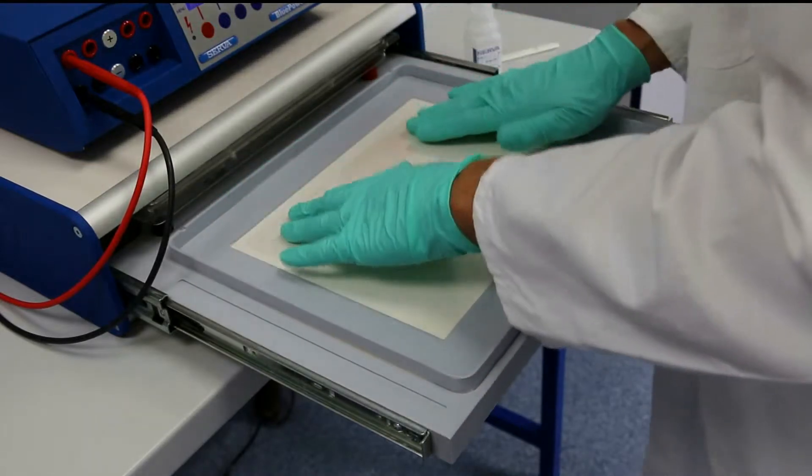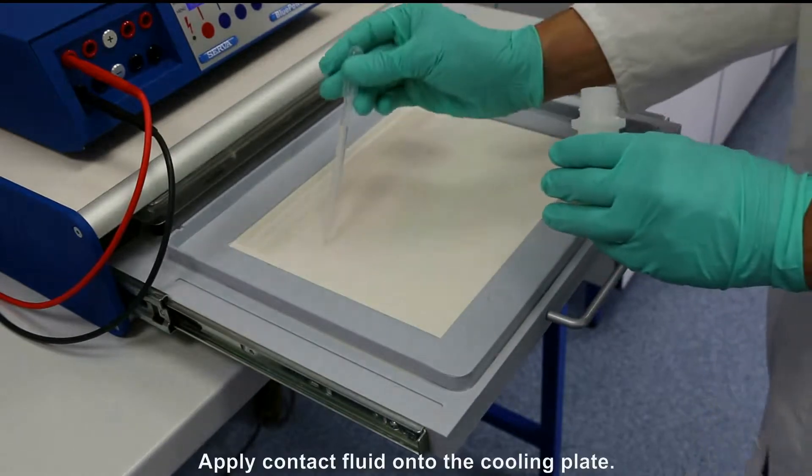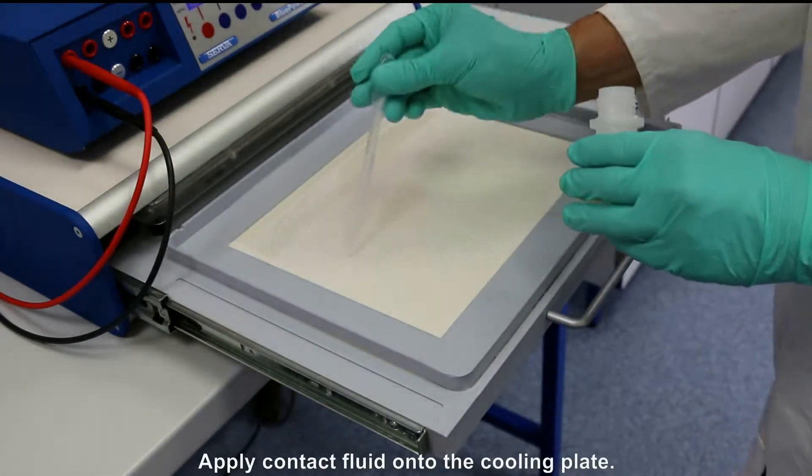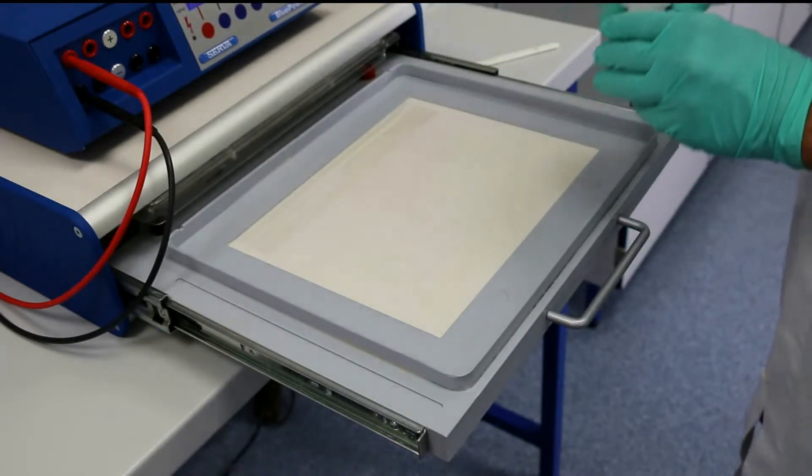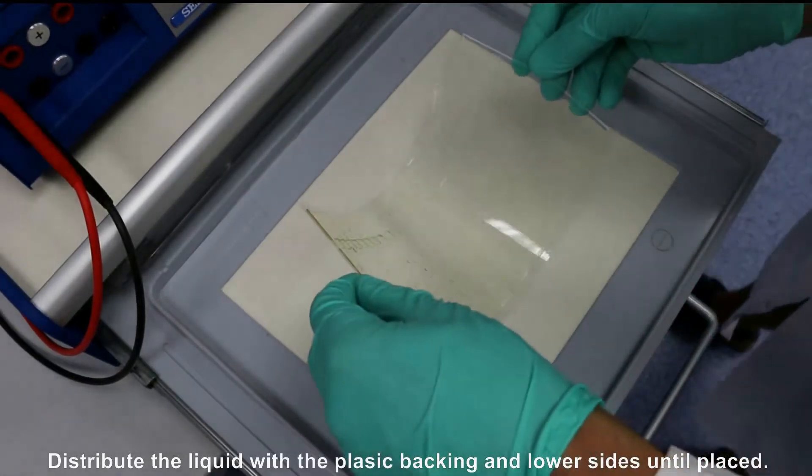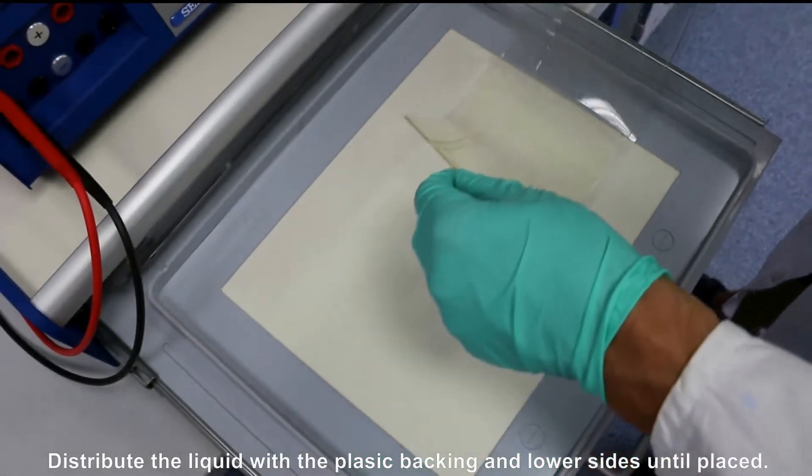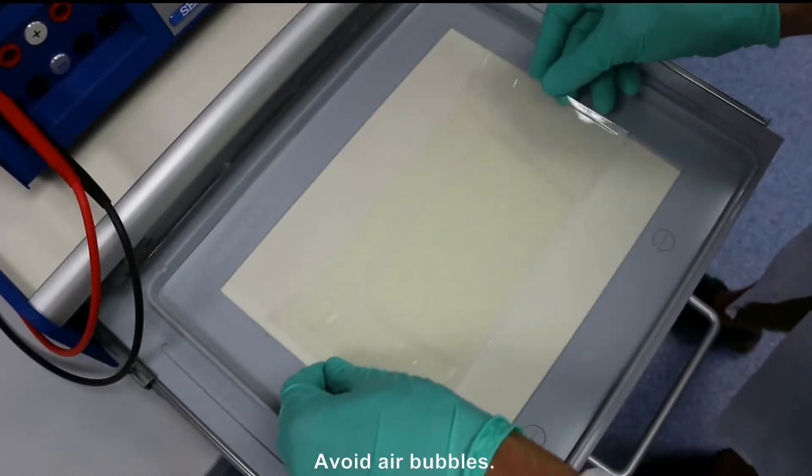First, apply the contact fluid onto the cooling plate. Dispense it in an H-shape. Unpack the gel, remove the covering film and distribute the liquid with the plastic backing. Lower the sides until the gel is placed.